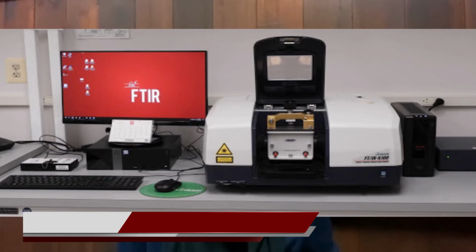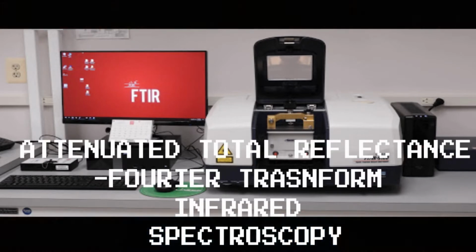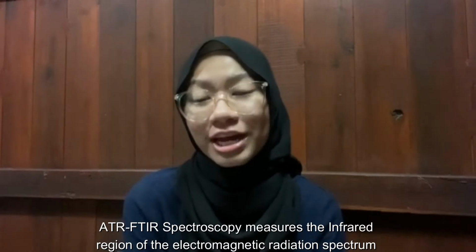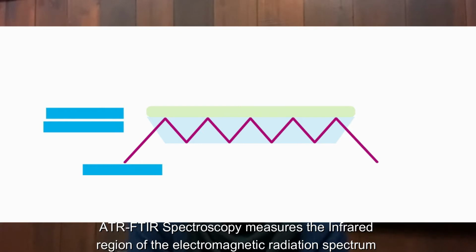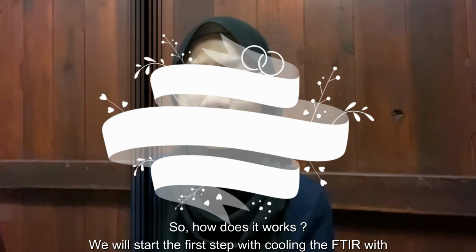Proceed to the next instrument, ATR-FTIR spectroscopy, which stands for Attenuated Total Reflectance Fourier Transform Infrared Spectroscopy. This instrument is used for the analysis of microplastics, which are less than 1 mm in size. ATR-FTIR spectroscopy measures the infrared region of the electromagnetic radiation spectrum, which has a longer wavelength and lower frequency than visible light. So, how does it work?